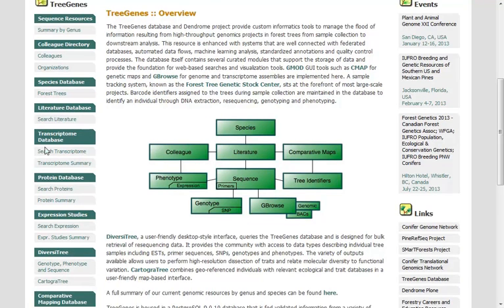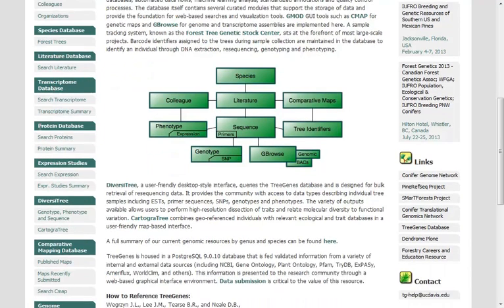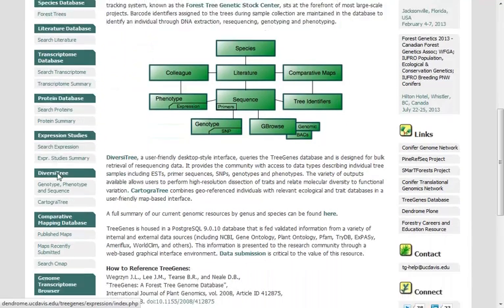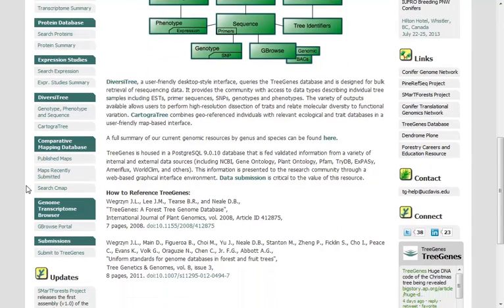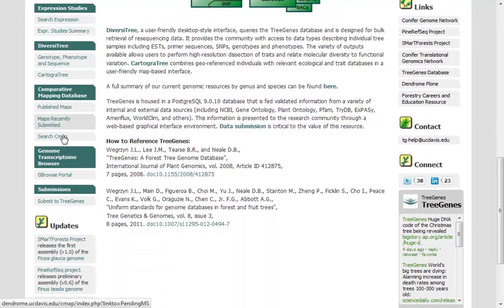So there are sequencing resources that are organized for you. You can find those folks who are working in this field. Species databases, literature database, transcriptome, protein, expression, diversity, and mapping, and genome browsers and so on.